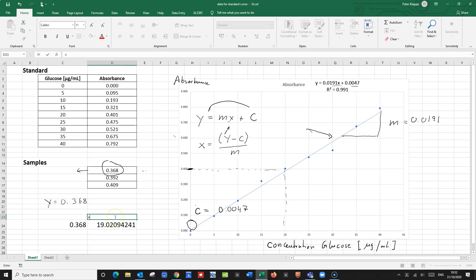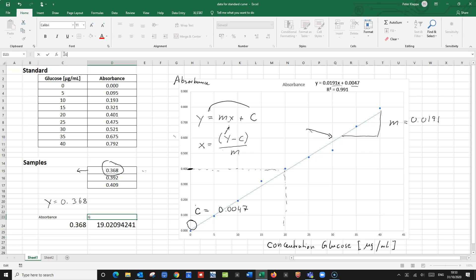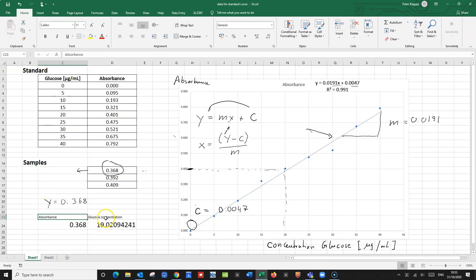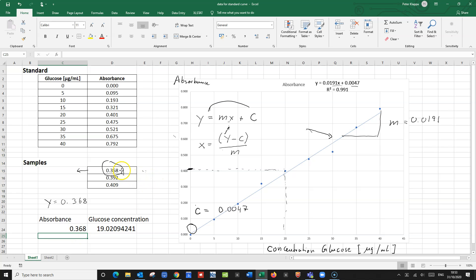So that would be the X value — the glucose concentration. A glucose concentration of 19 microgram per milliliter would give us an absorbance of 0.368. So we have taken our absorbance — that is the Y value of the sample — and reverse-calculated the corresponding glucose concentration that would give us this absorbance.